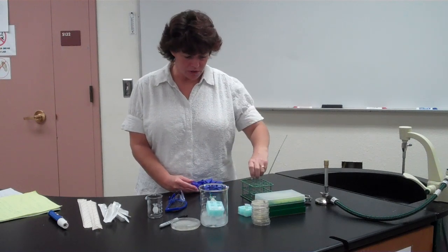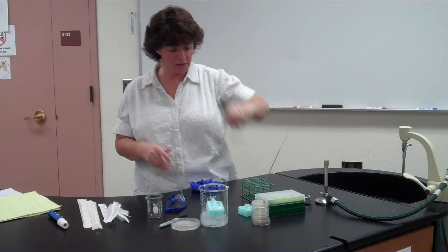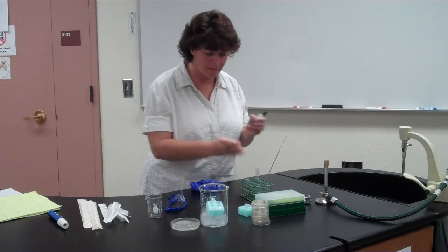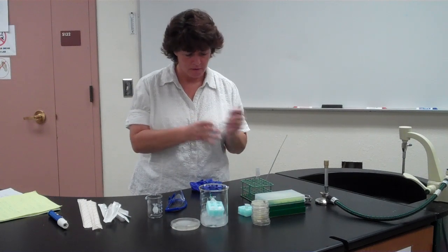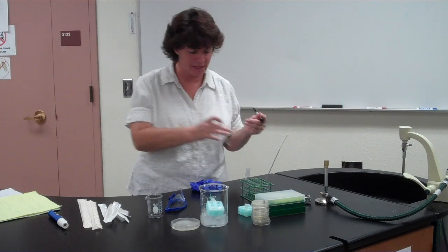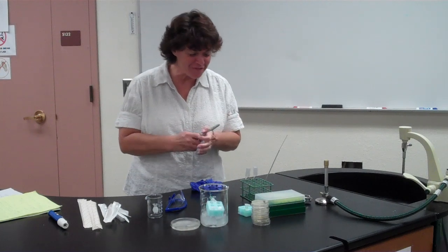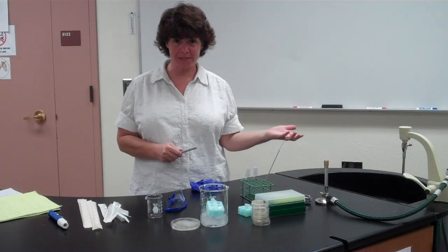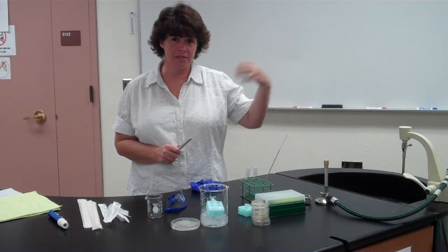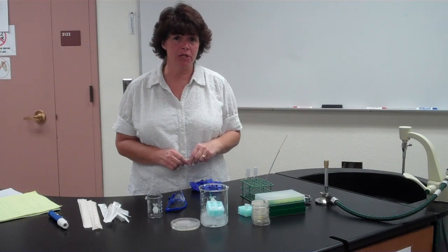So the first thing that you're going to do is you have two sterile tubes. These two tubes that we've had cultures in, but these are sterile, they have nothing in them. You're going to label them DNA positive and DNA negative. Now the DNA positive and negative stands for the fact of whether or not you're going to put the plasmid in. The plasmid, you remember, is a circular DNA that's different, not part of the normal chromosome of the bacteria, and it's going to carry particular genes.